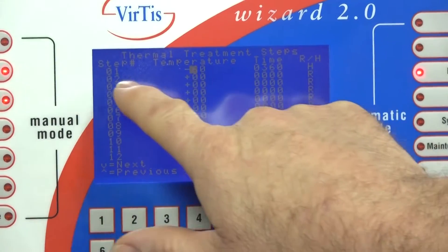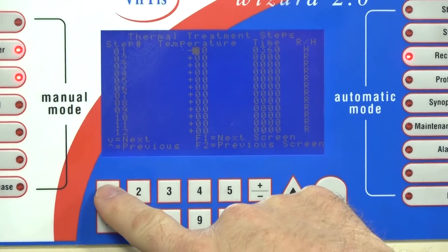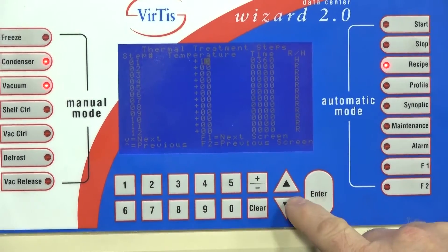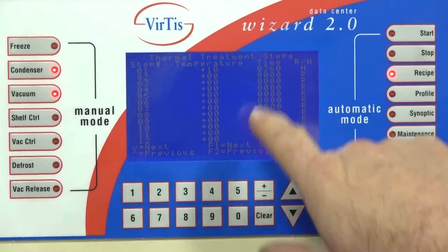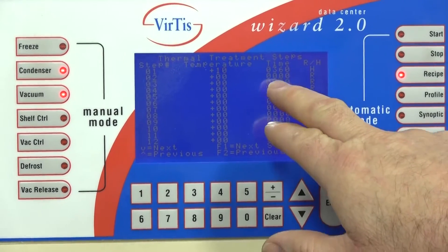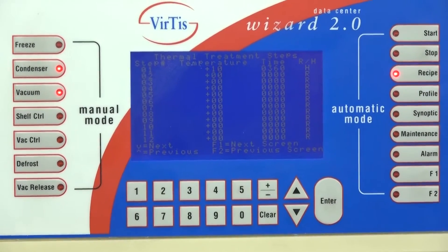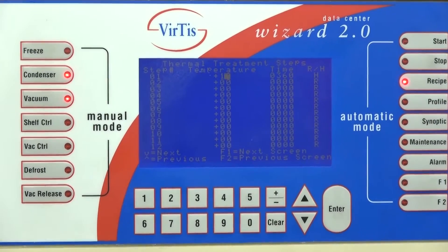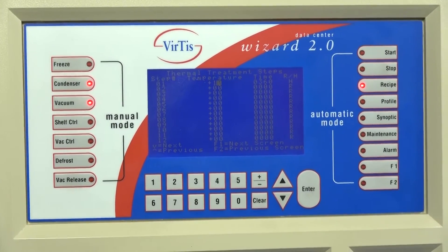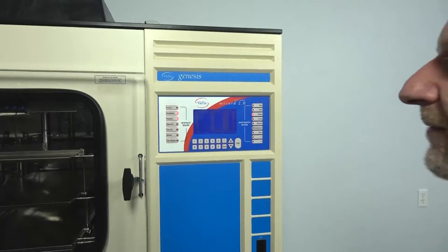You can start at step number one and say you want to get it down to, say, 10 degrees — so you enter plus 10, then come over and bring in the time. You can set it for 10 minutes or however long you want. You've got 12 individual steps just in the thermal treatment, and some products really need very precise freezing times. That's what makes the Genesis and the Wizard 2.0 probably the most valuable because of that option.